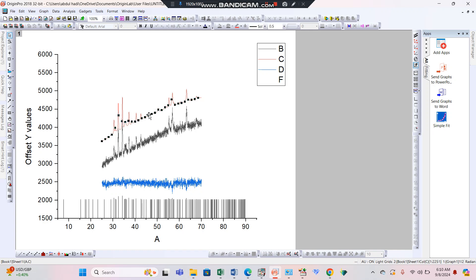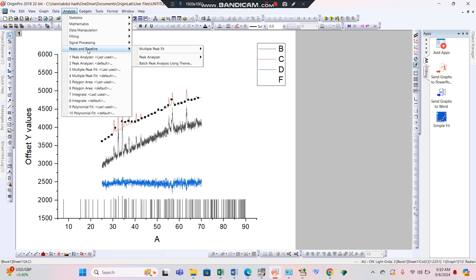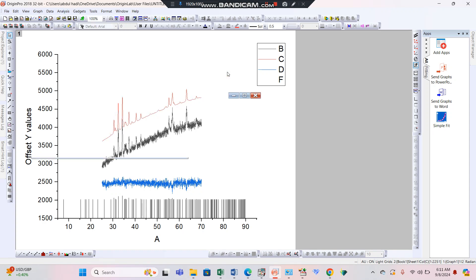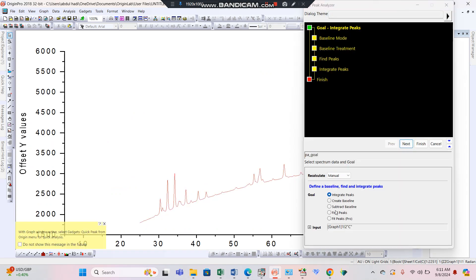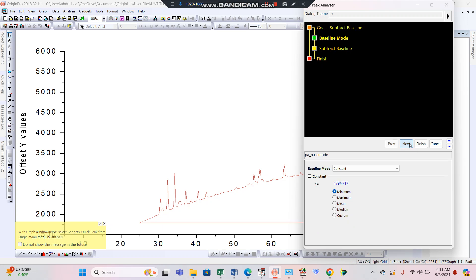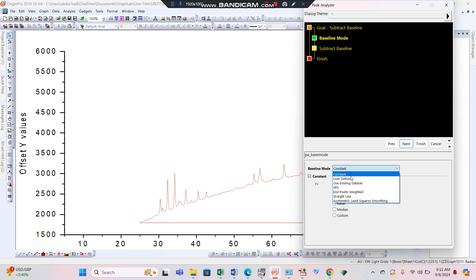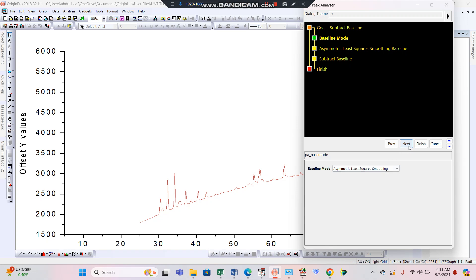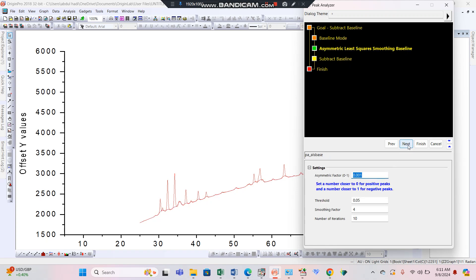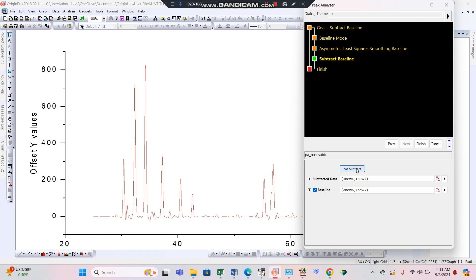Now apply this same procedure on the I-calculated. Repeat the analysis: go to Peak and Baseline, then Peak Analyzer, and select open dialogue box. Again choose subtract baseline, then for the method choose asymmetric. Press Next — this straightens the zero data. Press subtract and you can see this line also becomes straight. Finish this process.